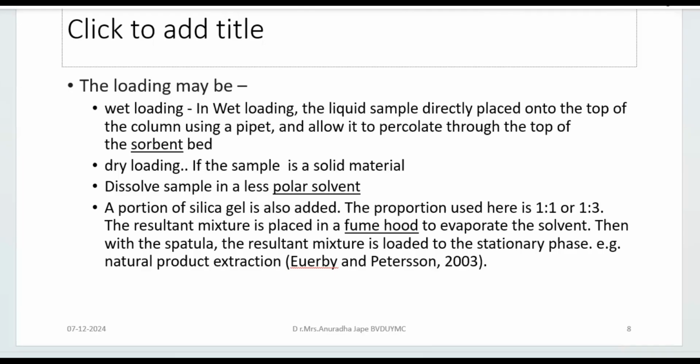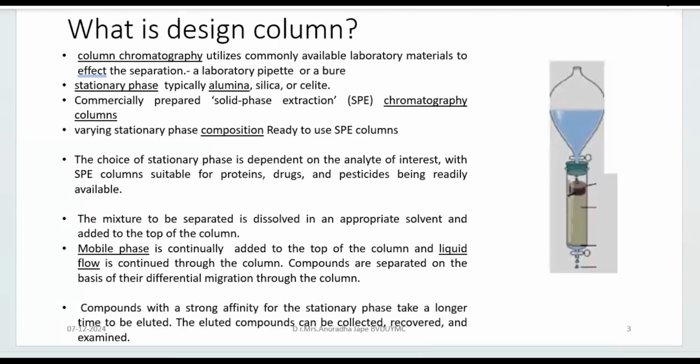So it is going to help regular distribution across the diameter of the column, and then the sample will run down the column bed. So more mobile phase is to be applied, to a height of 2 to 5 centimeters, and then the column is connected to the mobile phase reservoir. If you see the previous simple design that we had shown, so this is your column, right?